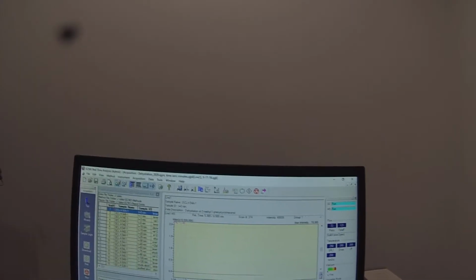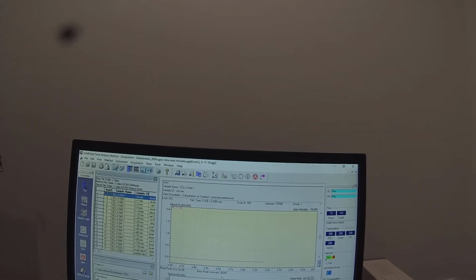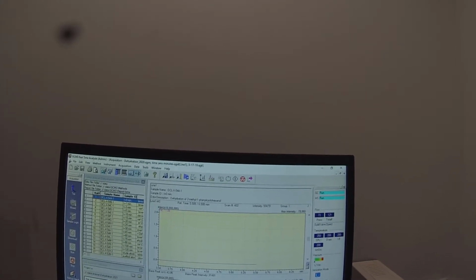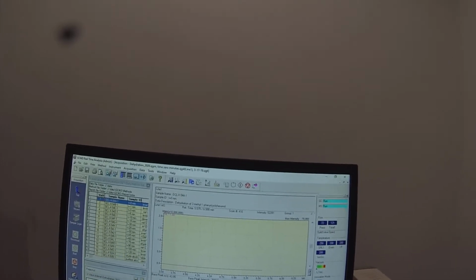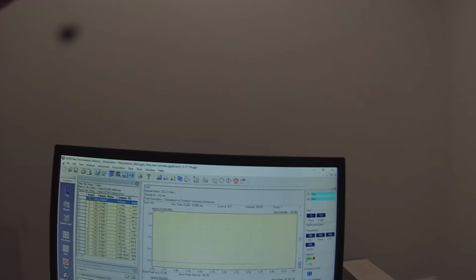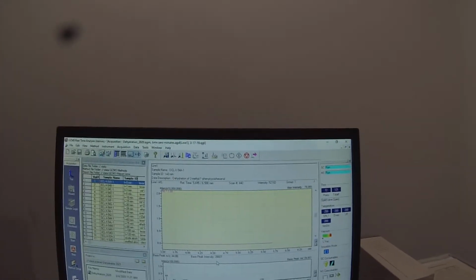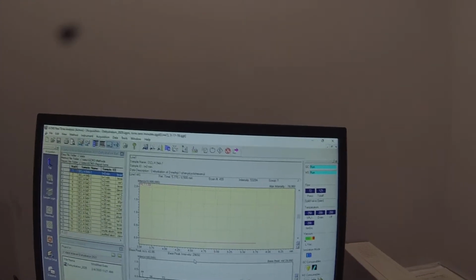actually see that. I can run an IR later on the purified alcohol and see if that carbonyl peak that was present in the crude alcohol is gone. My guess is it won't be, because the ketone has an RF so similar to the alcohol. So we probably didn't actually succeed in getting rid of all of the ketone, assuming there was much. Shouldn't be much anyway.